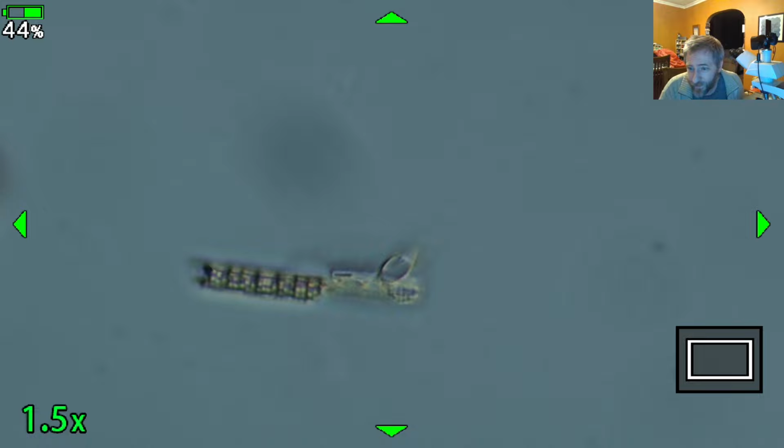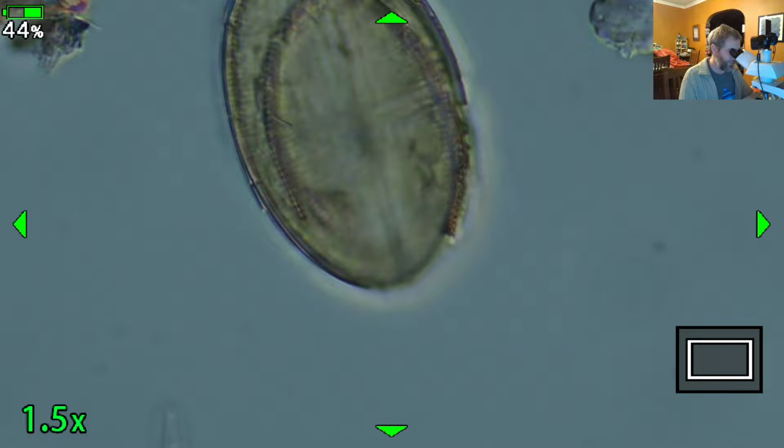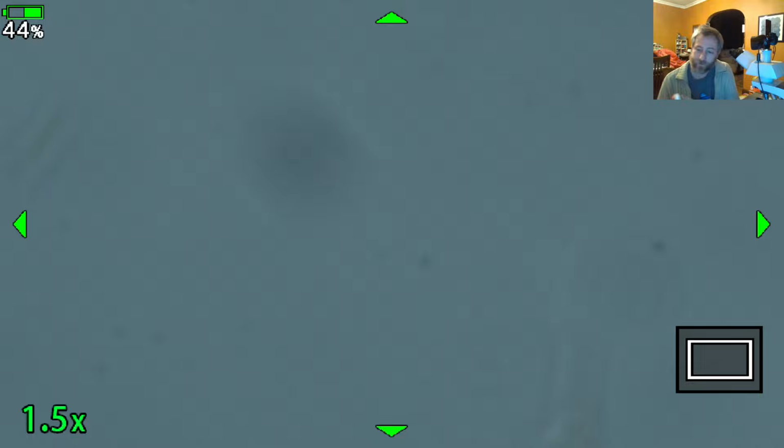Let's see. Diatoms have some very interesting processes for reproduction. Diatoms reproduce in a very interesting way. Most of the time they reproduce by... So I was using this as a little prop earlier. If we think of centric diatoms, which basically look like little circles, I've got two valves, one is red and one is white.